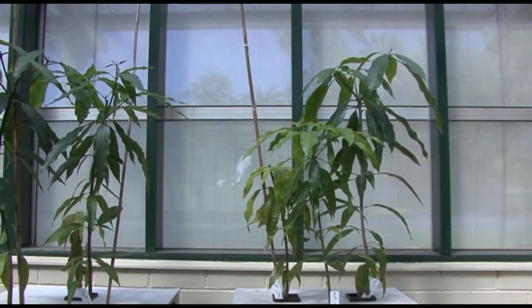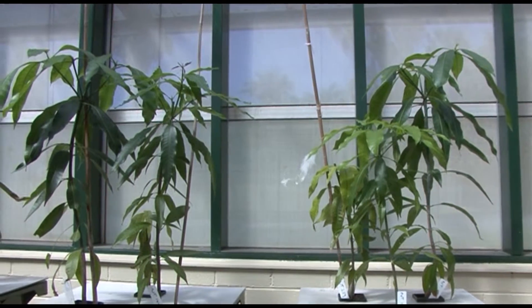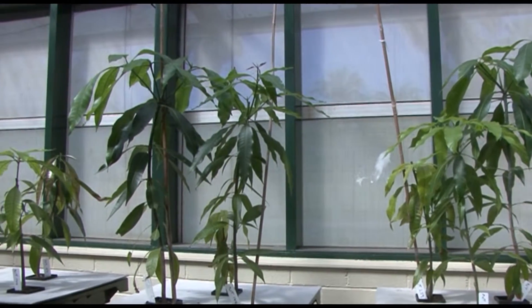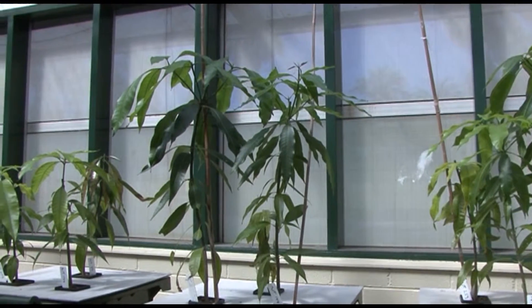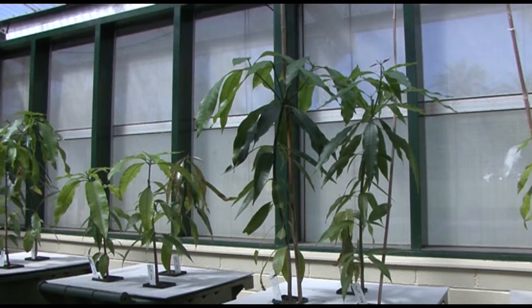Hi, I'm Cameron McConkie. I'm the research leader for the plant industry. Today I'm going to show you the aeroponic system for growing mangoes. The aeroponic system has been set up so we can monitor the effect of plant growth regulators which are added to mangoes and monitor the response of the plants very precisely.